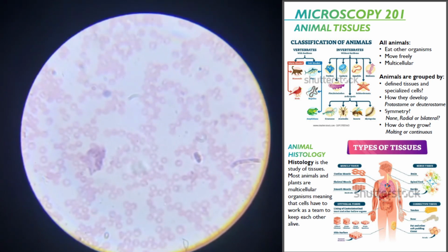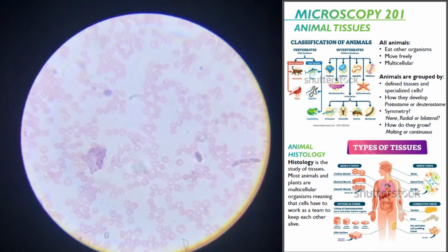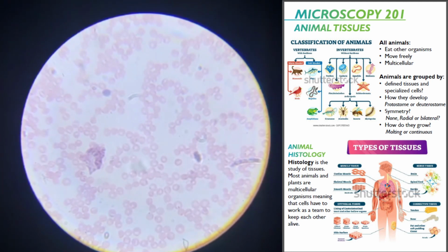Wow. So if that had a better nucleus, I'd say that would be a megakaryocyte. So mega meaning gigantic, karyo, remember the nut or the nucleus, cyte means cell, megakaryocyte. In other words, reading it backwards, it's a cell with a nucleus that's big, megakaryocyte.